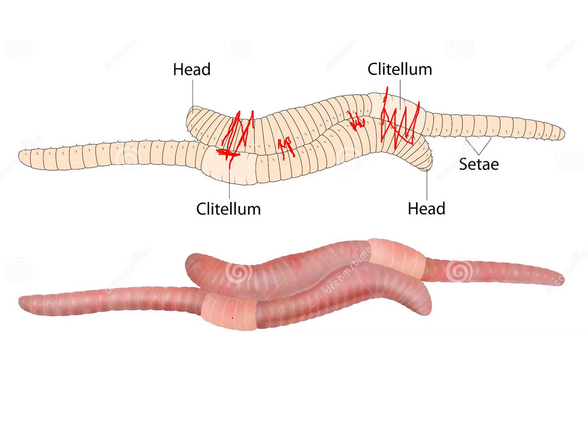This firm grip allows proper exchange of sperms from the male genital pores. We know the sperms produced in one worm are stored in its seminal vesicle, and they come out from the genital opening of the worm. For example, in this worm, toward the anterior side on segment number 15, is the male genital pore.